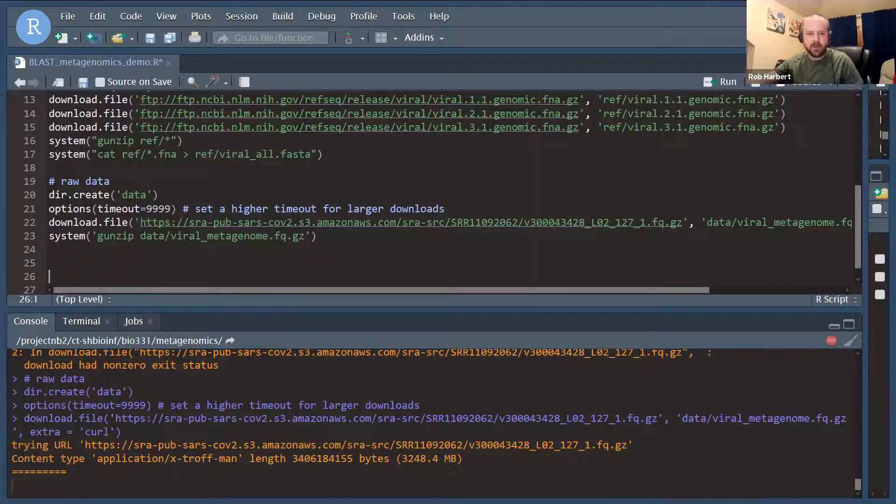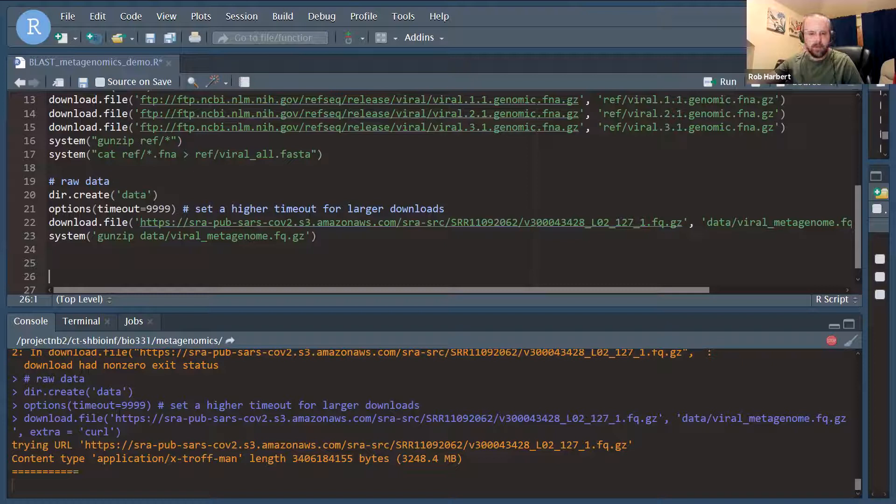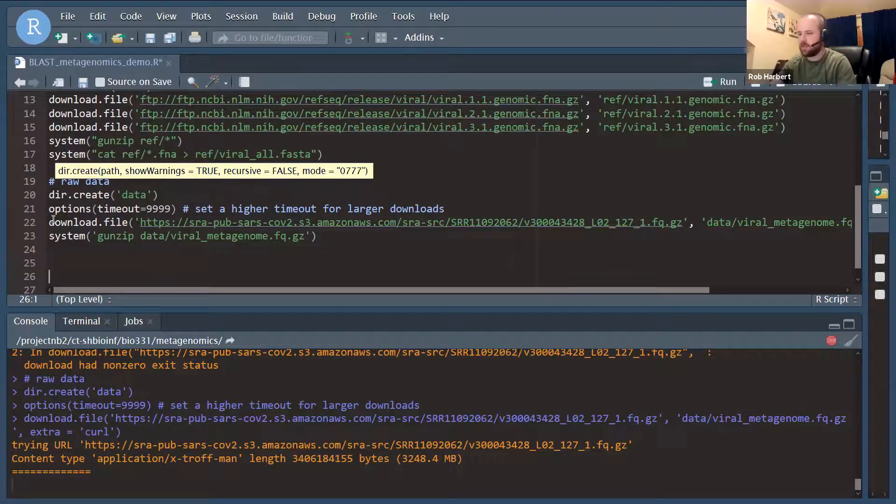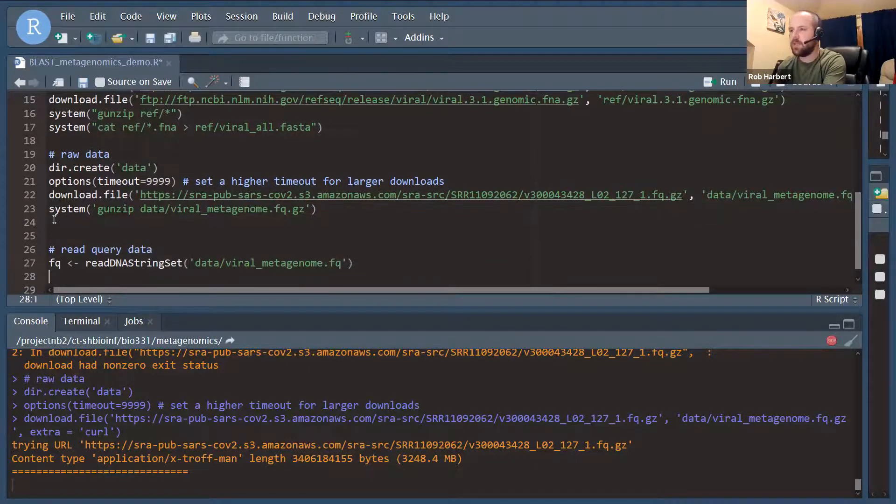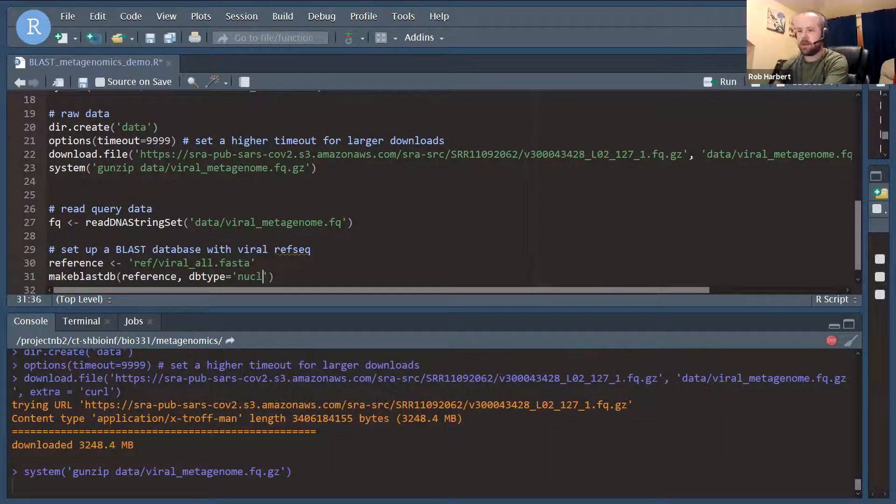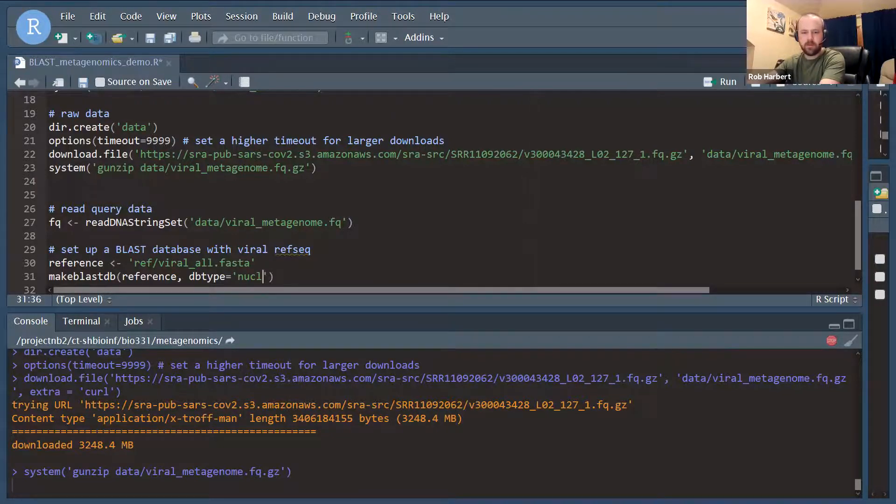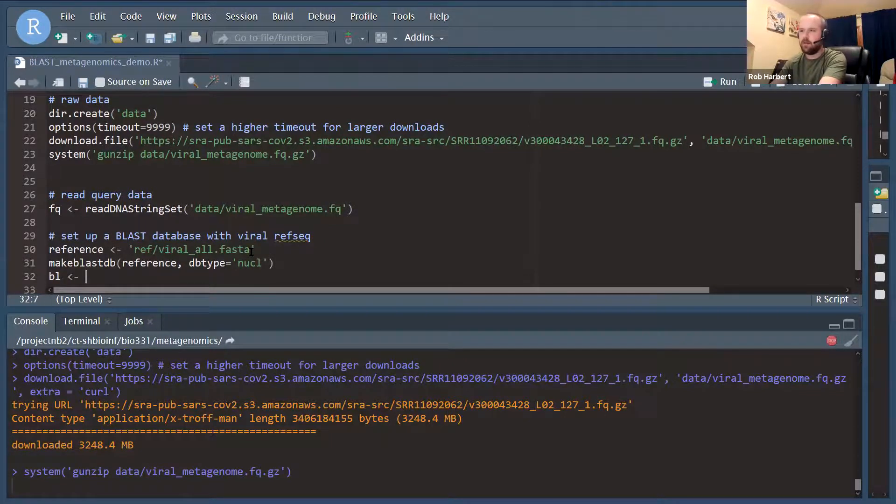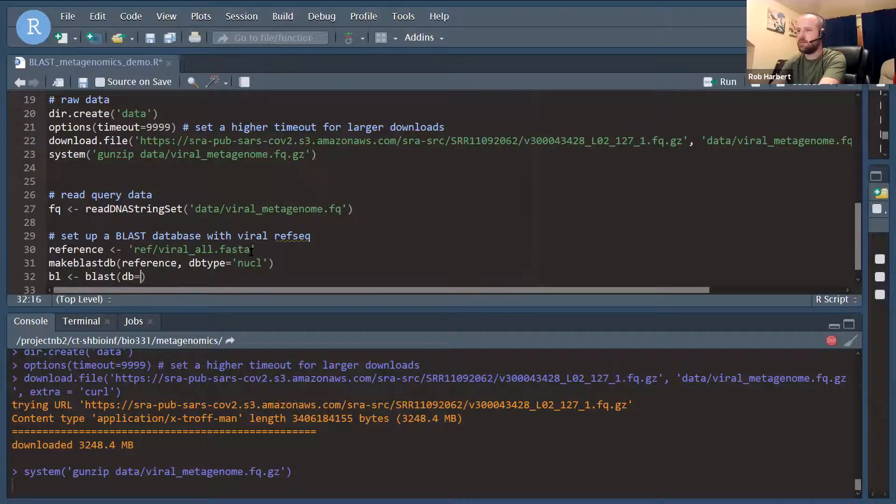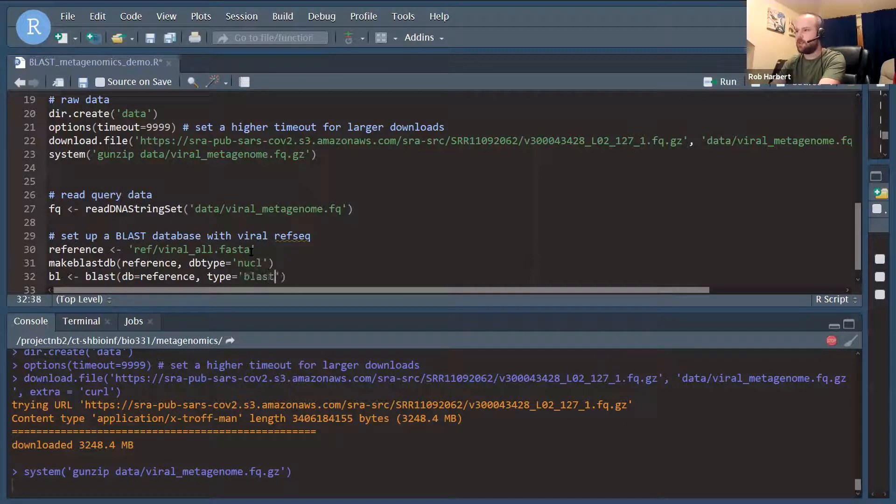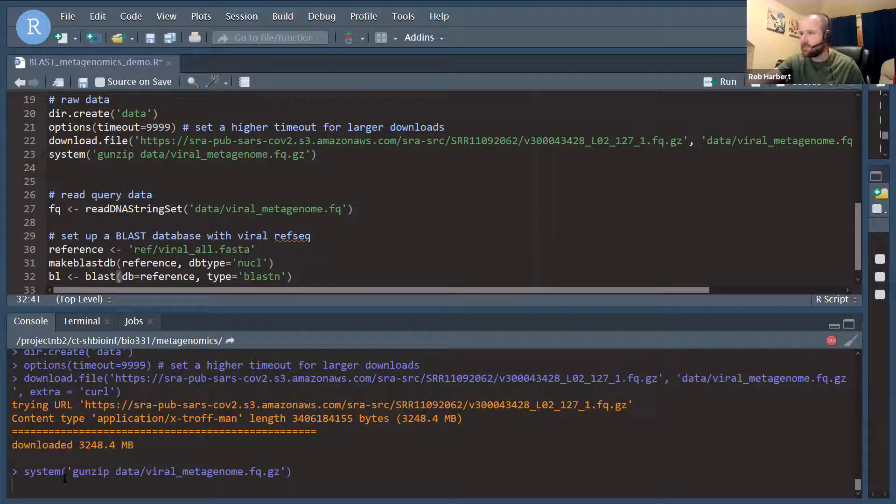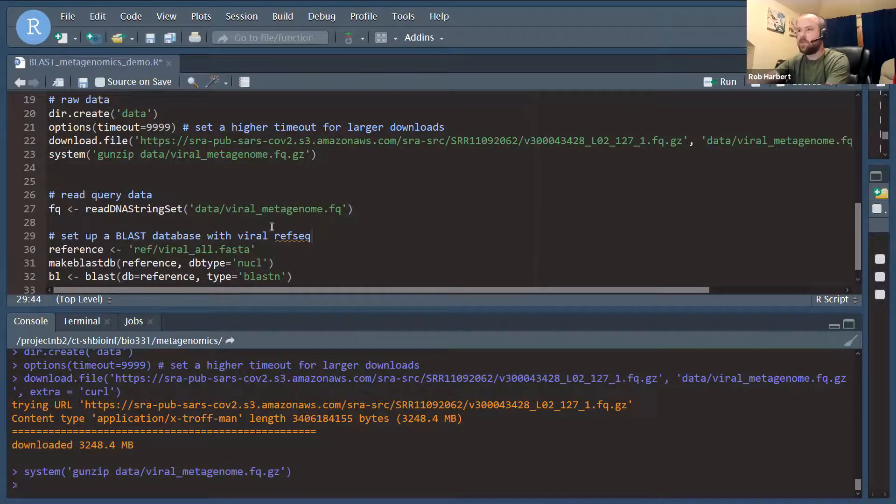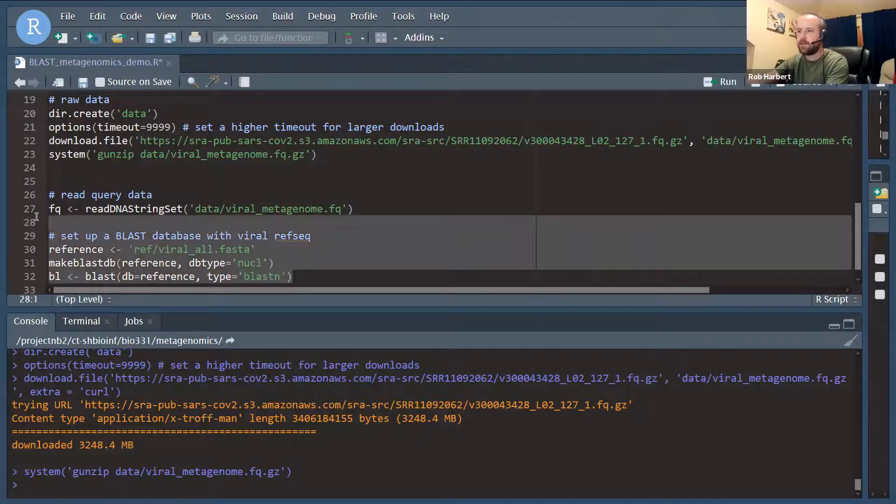While that's running, I'm going to set up a couple of lines of code to read in the raw data once it's unzipped and set up the BLAST database that will read in the query data. We'll also need to set our connection to the database, so we should do that here with the BLAST function, db equals where the reference file is, and our type here will do BLAST in this time. It looks like down here in the console our raw data have downloaded and we're in the process of unzipping those. So we have unzipped the reference data, so let's go ahead and read that and make our BLAST database.